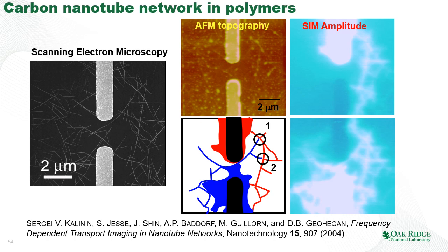And it allows us to remove the contribution of the ionic charge dynamic on the sample surface. So it is uniquely well suited for the mapping of the transport behavior in nanoscale systems. So if I bias the bottom electrode, I can see that a much larger part of the system is biased, and I can compare the biased region using the top and bottom electrode and find the regions where the potential drop happens.